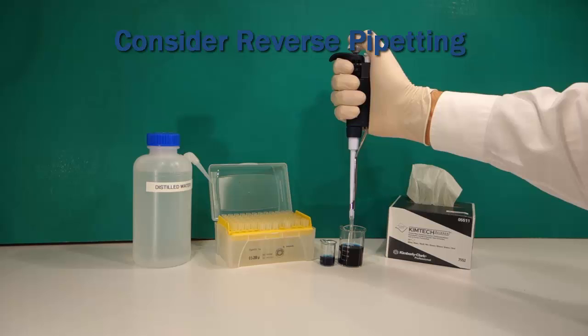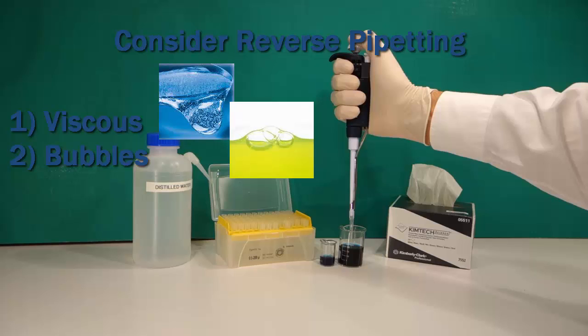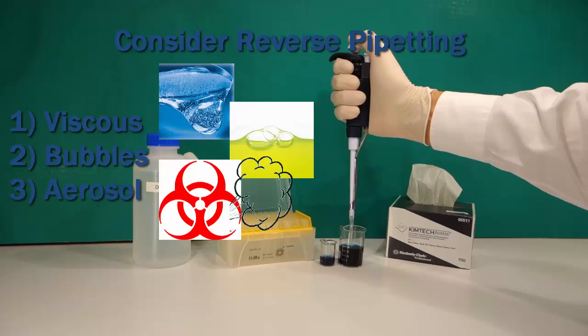Reverse pipetting may be more accurate or a better technique when you pipette liquids that are slightly more viscous, such as 20% glycerol or blood serum, or when bubbles could cause a problem, such as when reading a 96-well plate. If the liquid is viscous, pipette slower than normal. Also consider this technique when a cross-contamination or infectious biohazardous aerosol could be created if a bubble burst on blowout.